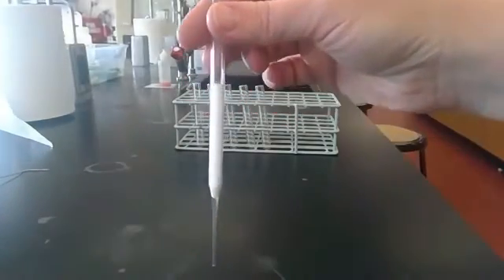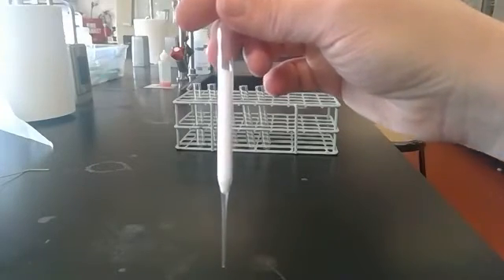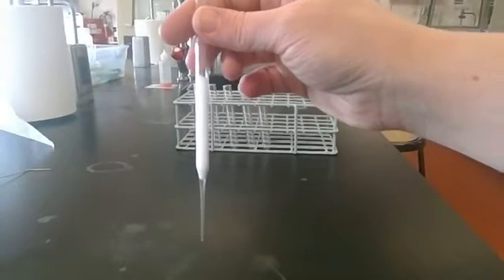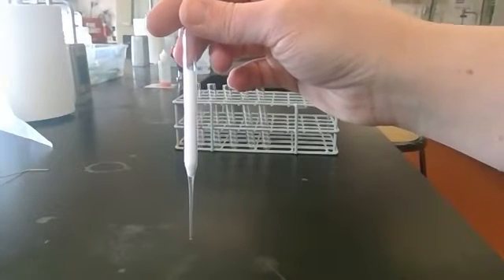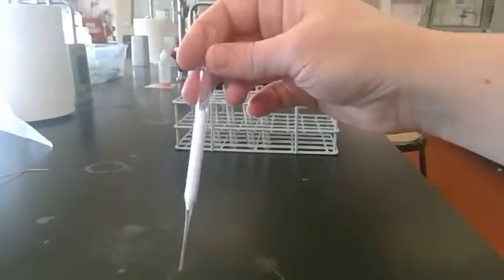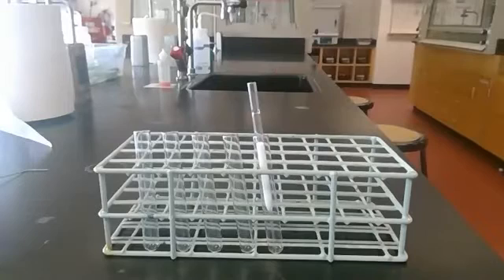And so what I'm going to do is prep this column and fill it with the solvent that I'm going to use in the experiment, which is going to be something that is less polar than water. We're going to go with a 90% isopropanol solution. So it's 90% isopropanol, which is an alcohol. So it's somewhat polar, and water 10%, but isopropanol is much less polar than water and has a lot less hydrogen bonding capacity. And it has lots of carbon and hydrogen bonds. So I am going to kind of set this up. I'm going to use these little test tubes to catch my solvent.